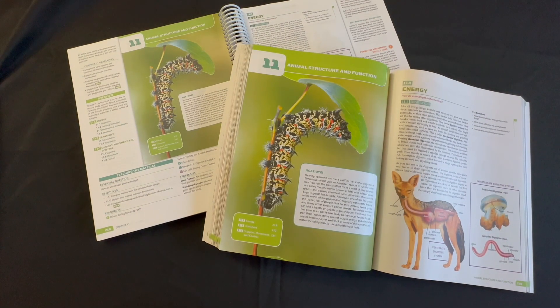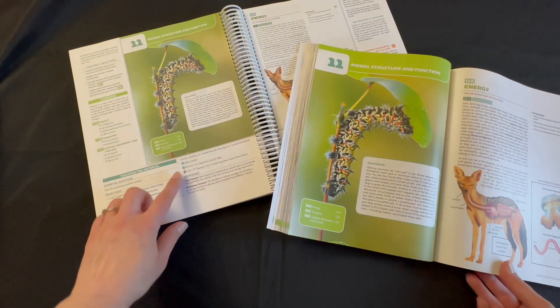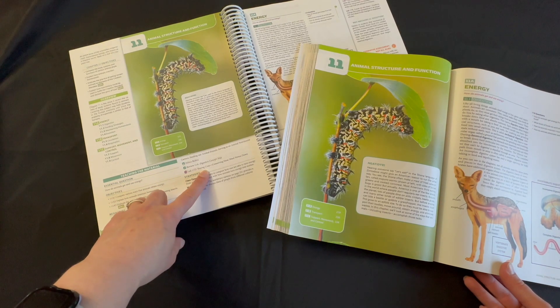Let's take a look at chapter 11. In this chapter, your student will be studying animal structure and function. In lab 11D, they will be looking at conserving heat — wool versus down.